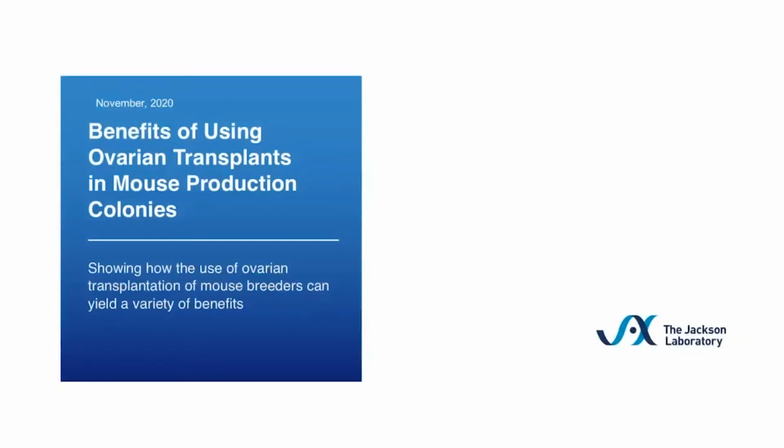So as she said, this is more of a focus on managing larger mouse colonies and the use of ovarian transplants. And I'm going to give you some examples of how JAX has used them, as well as the process and the different things that we look at in using ovarian transplants.